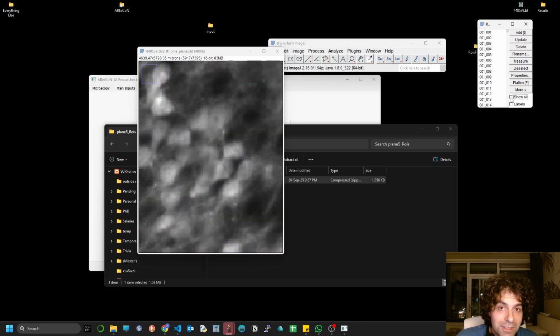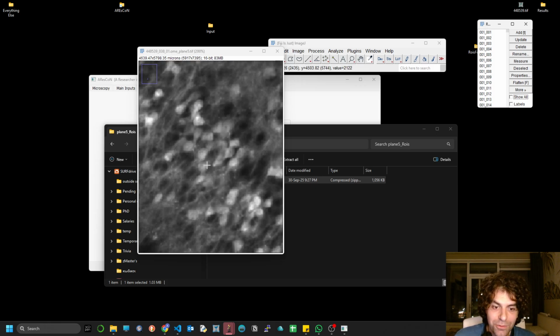However, that's the very reason that we're using many planes. What we want to do is utilize observations from different planes and create at the end an overall set of neurons that correspond to all possible observations that have been taken, and we know that they're real neurons, right?